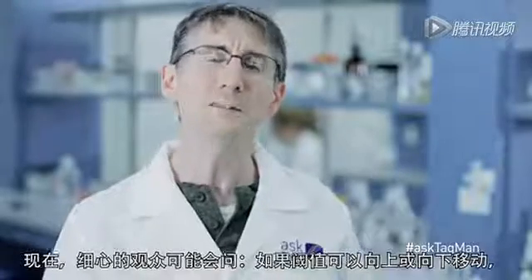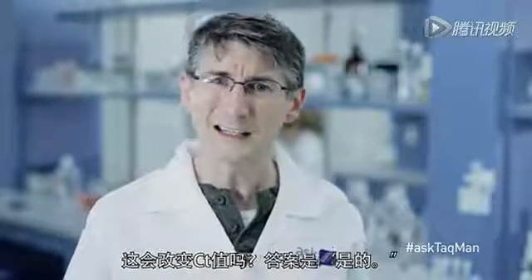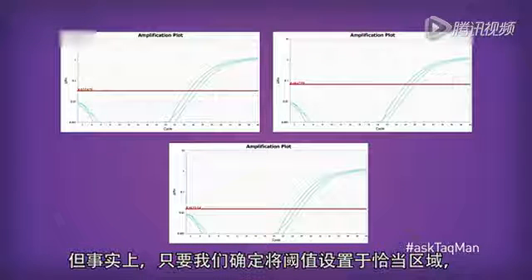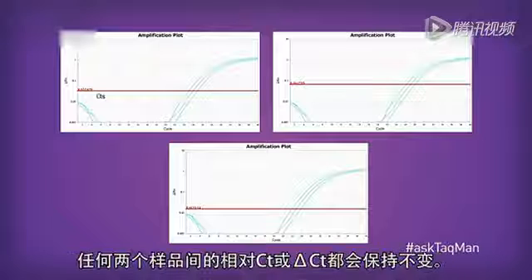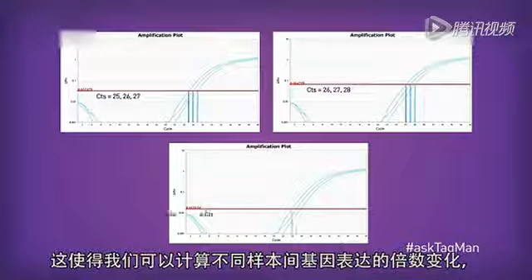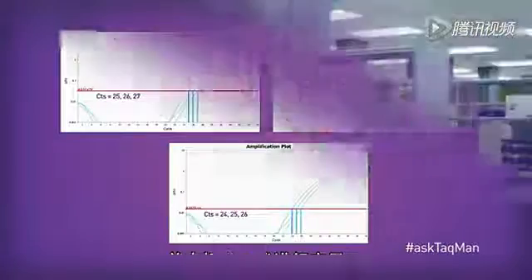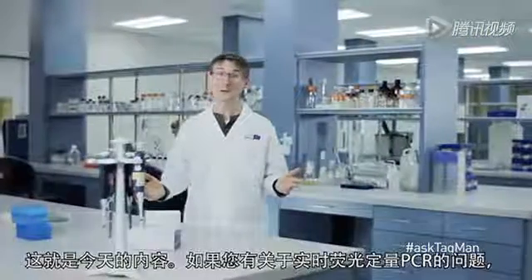The attentive viewer might be tempted to ask, well, if the threshold can be moved up or down, doesn't that change CTs? Why, yes it does. But here's the thing. As long as we keep the threshold firmly within the geometric phase, the relative or delta CT between any two samples stays constant. This fact allows us to do things like calculate fold changes in gene expression from sample to sample and to get quantity information from a standard curve. And that's all there is to thresholds.